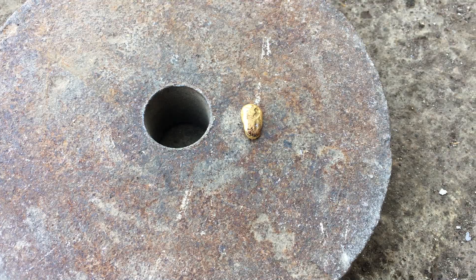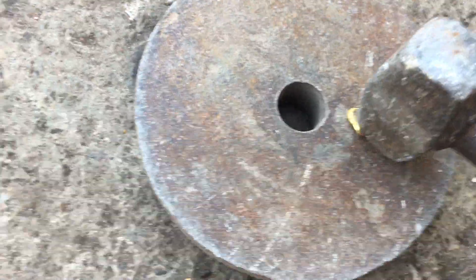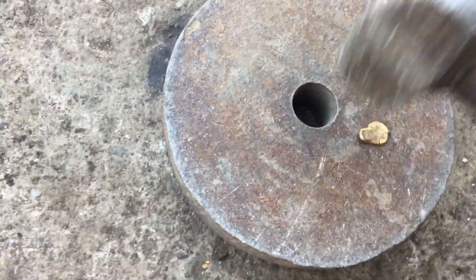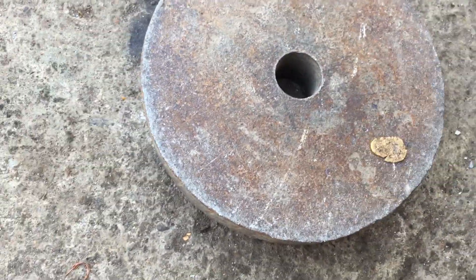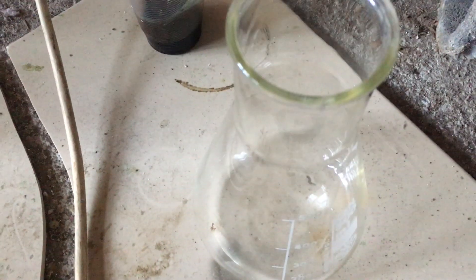To increase the surface area, I flattened the gold nuggets using a hammer. After cutting the flat gold into small pieces, I placed it in a flask.